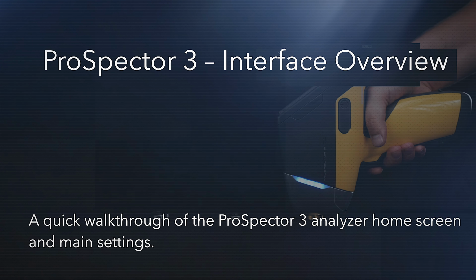So let's press it, and the first menu item you see is language. Here we have more than 10 languages that you can choose. The next menu item is monitors. Here you see the status of all the components of the analyzer. You see the voltage, the battery monitor, X-ray tube, and so on.